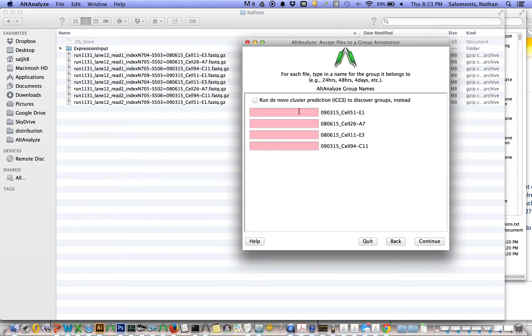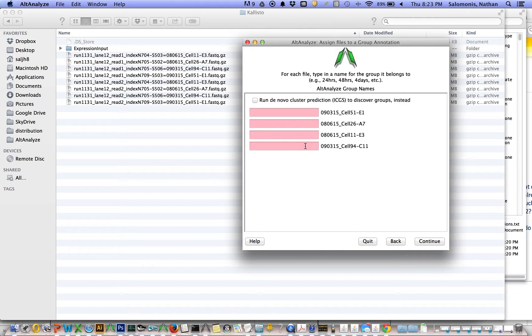At this point, I can either designate what these samples are. These happen to actually be single-cell RNA-seq samples. So let's just assume I don't know what these are. I don't know which ones are particular cell types or disease samples. So I'm just going to say run de novo cluster prediction.